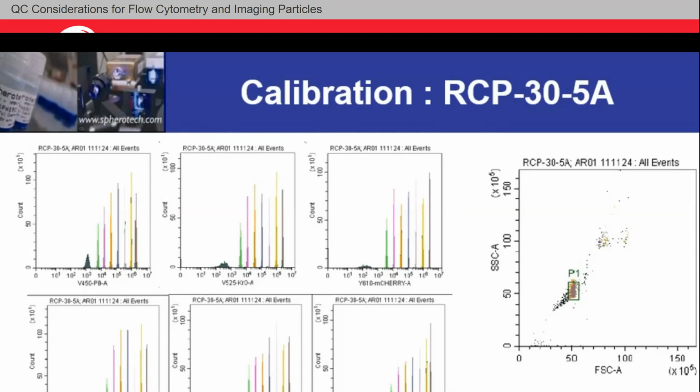Some areas I've seen it. One of the most common places I see it is in hospitals in New York. They have some of the most robust auditing, technical support, QA. It's wonderful. It can also be daunting. They will gate every single peak in every single channel. All of these are normal practices. No lab is better or worse for necessarily doing it. The important thing is, can you track it?